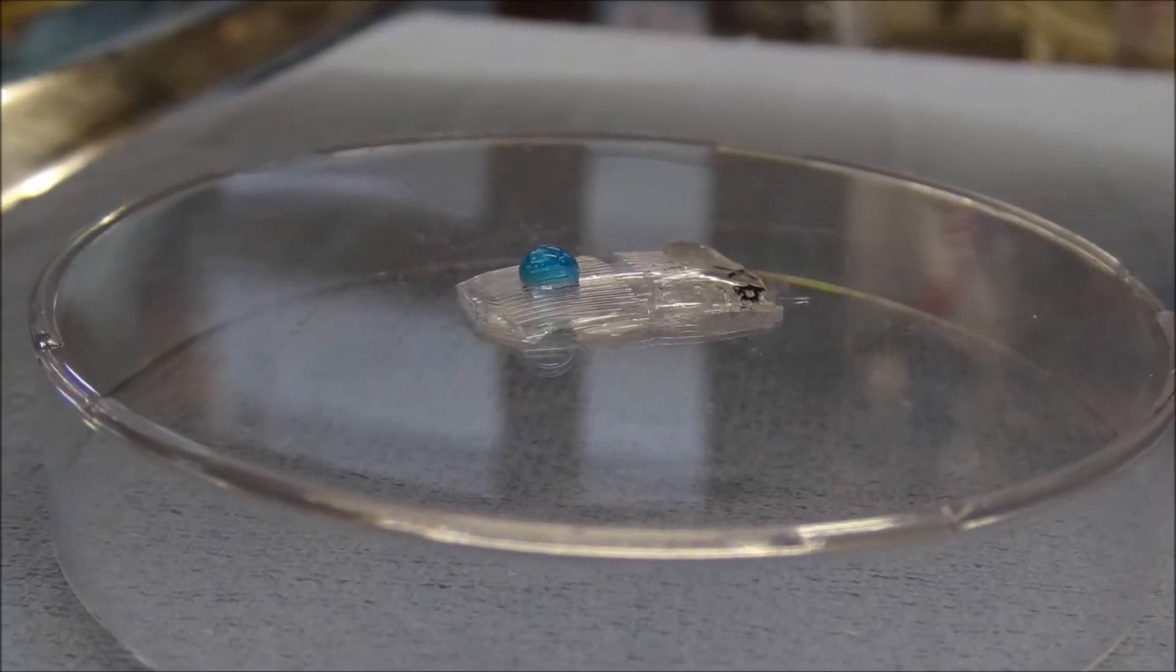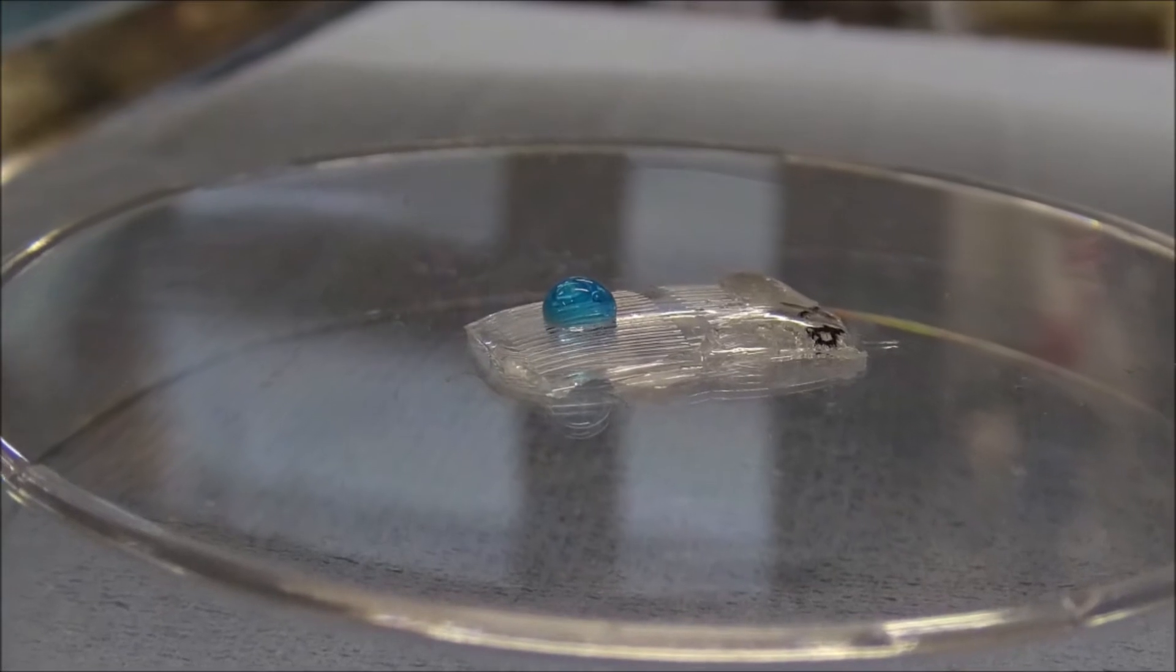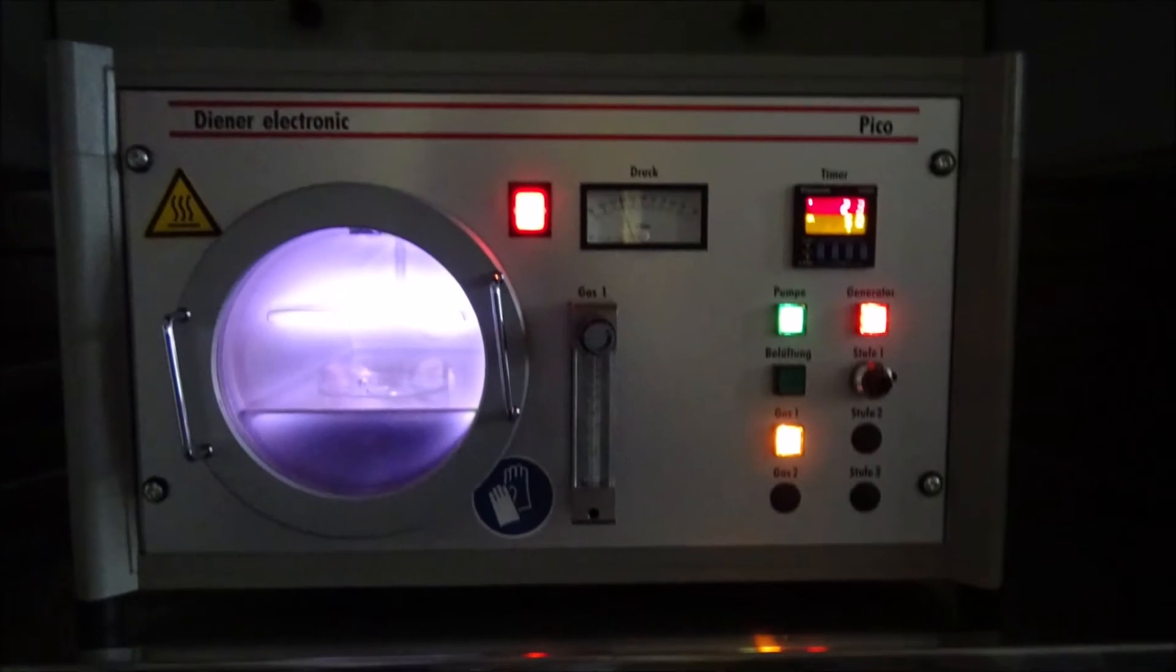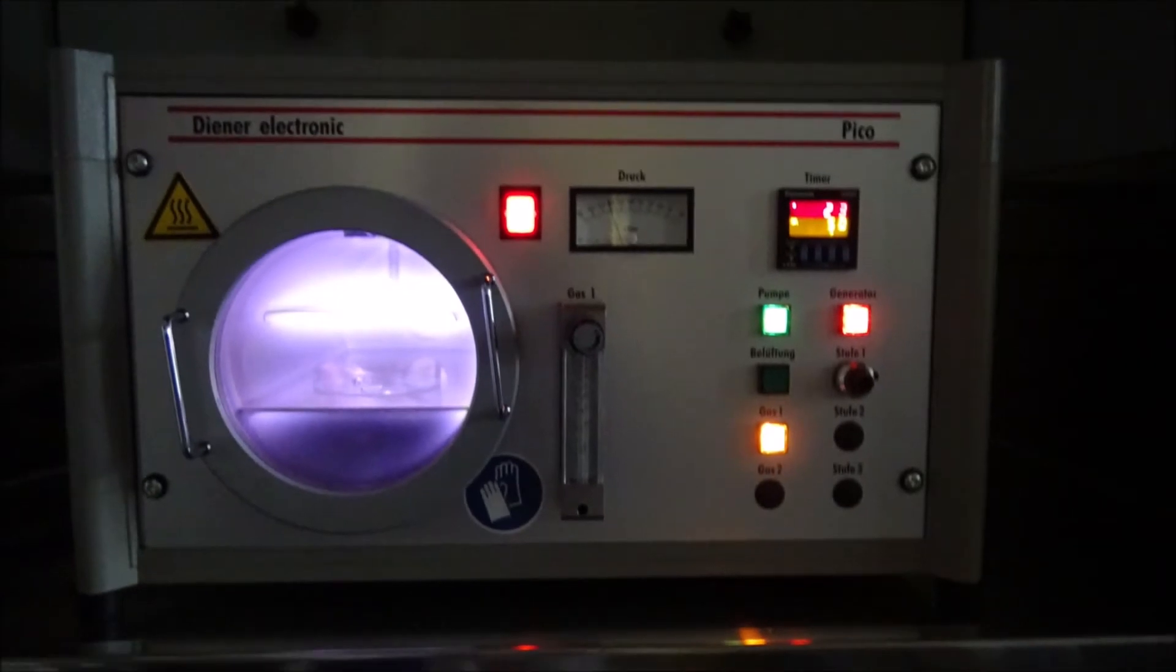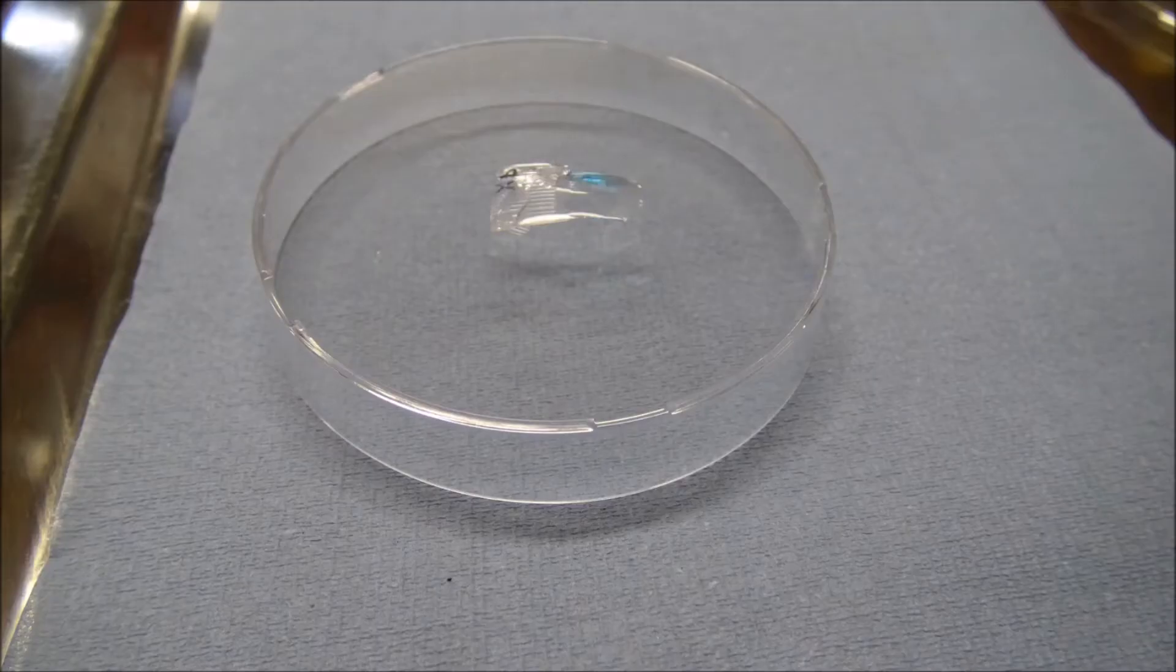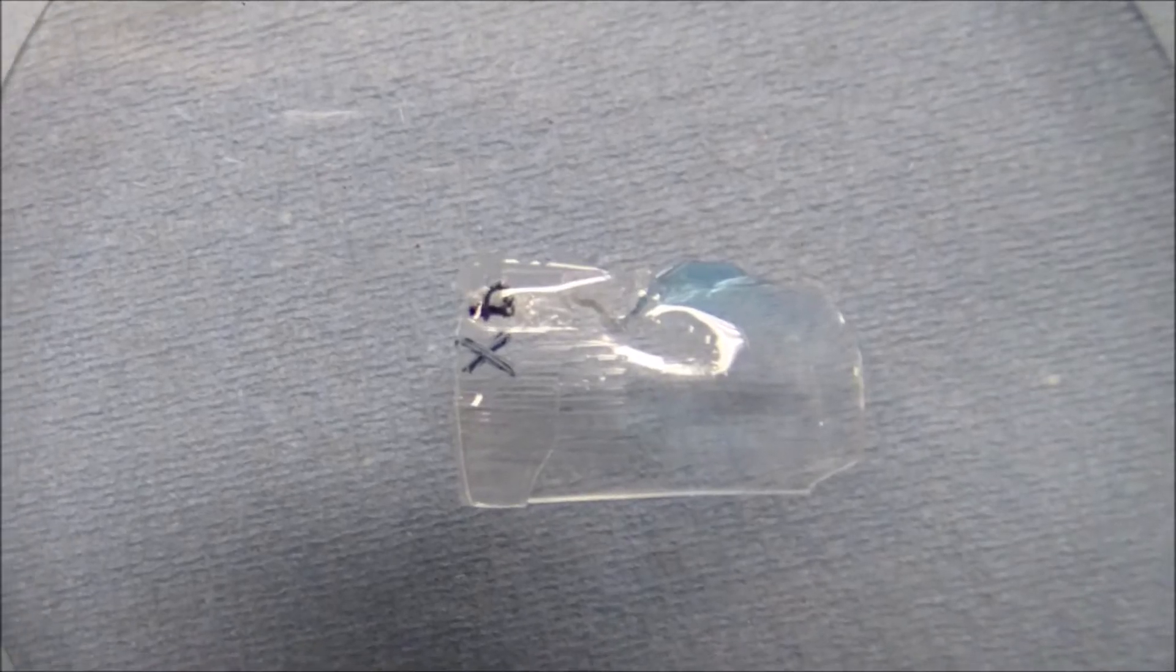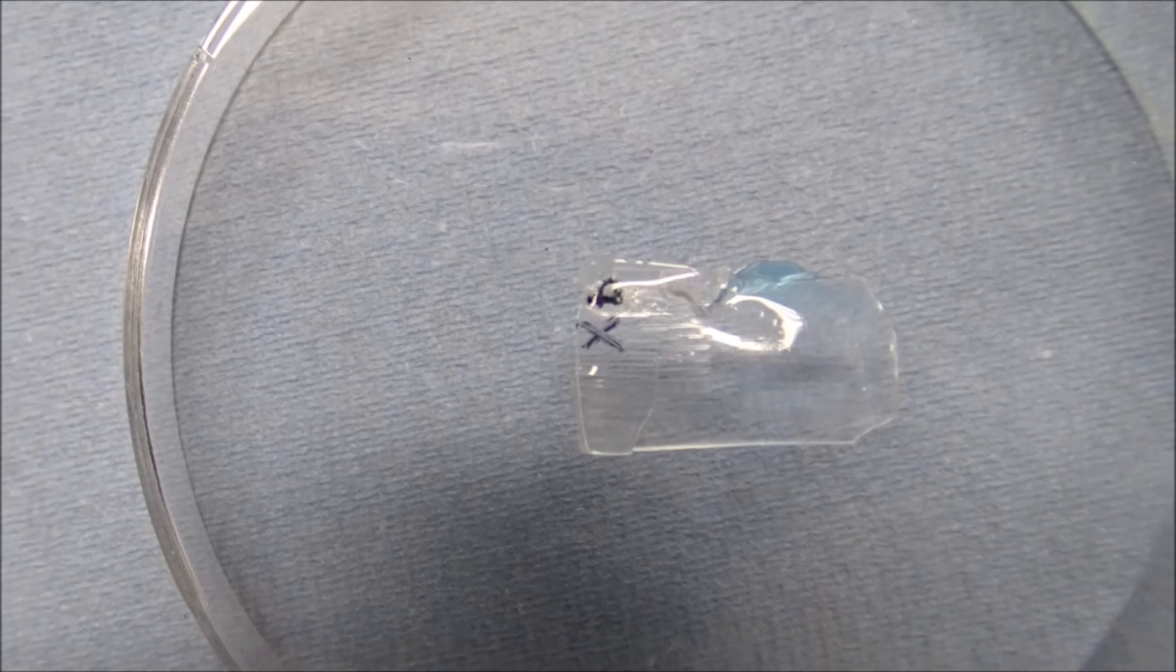We gained now hydrophobic surfaces. To achieve better cell adhesion on the surface, we had to coat the surface with fetal calf serum. Therefore, the surfaces were made hydrophilic by plasma treatment and then incubated with FCS overnight.